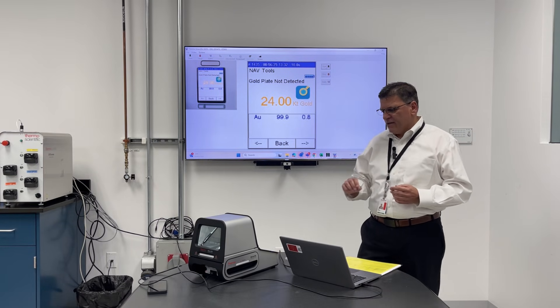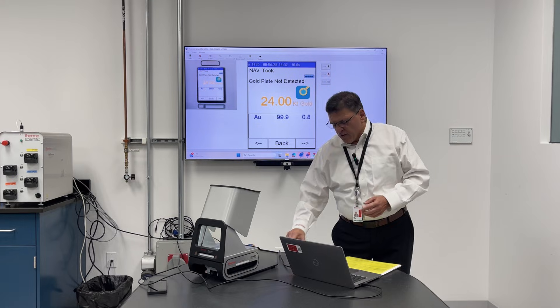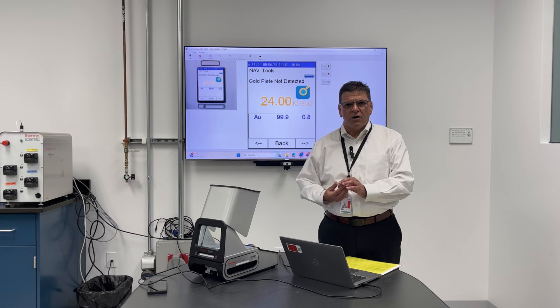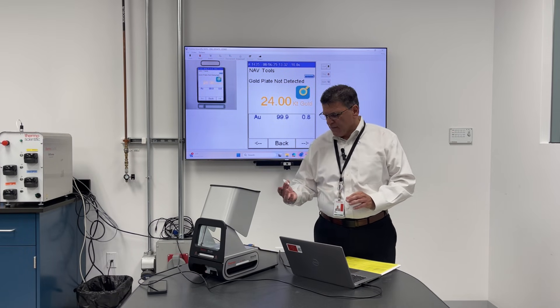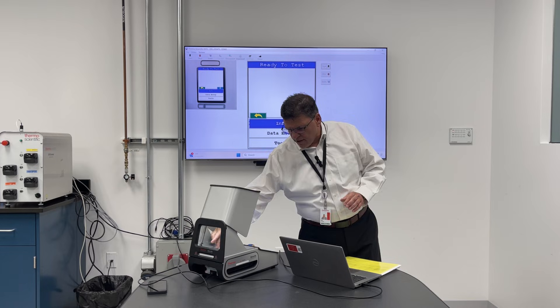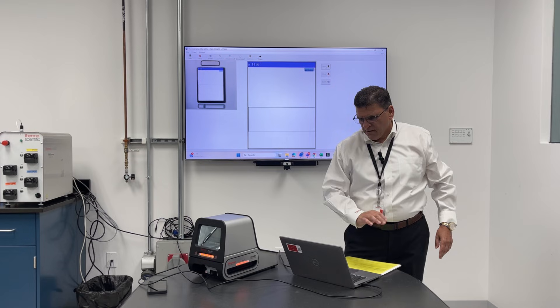This is the pure standard — your reference standard for showing the customer that the instrument is calibrated. Then when you look at different blends, the most common is 14 carat, based on the percentage of gold. 14 divided by 24 gets you 58.5%. So this is a 14-carat reference standard. Same process — put it in the center of the camera and close the analyzer.